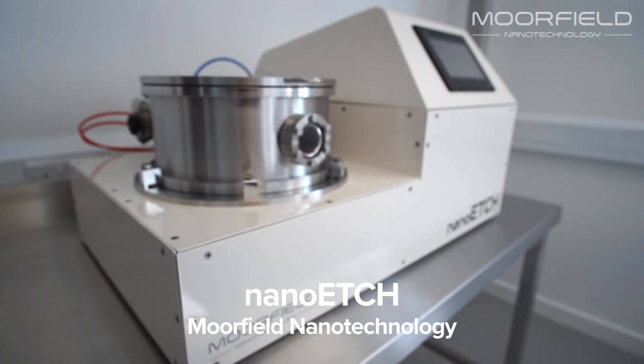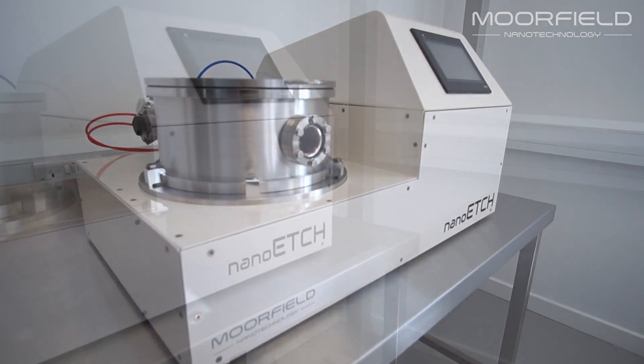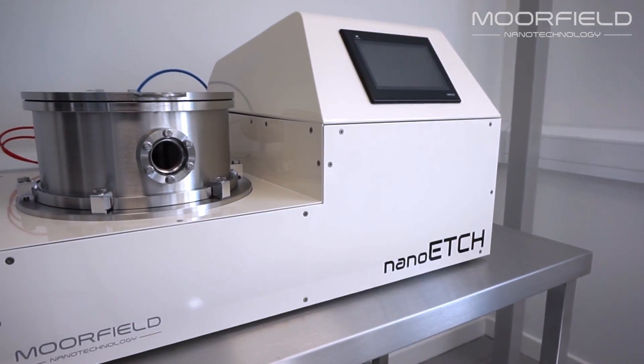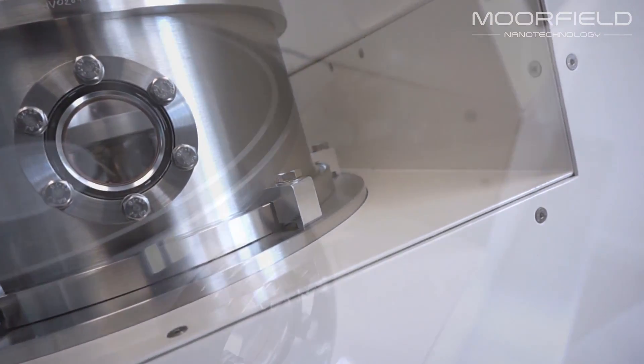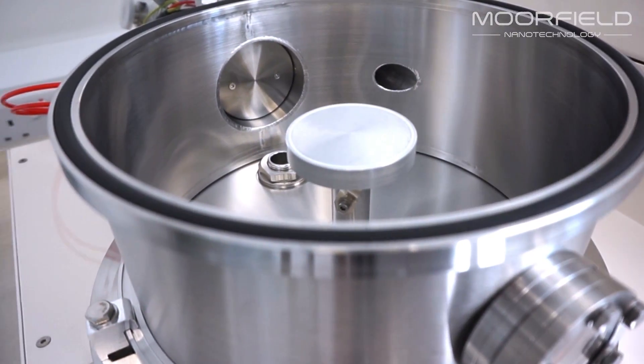The Nano Etch is a benchtop tool fitted with unique soft etching technology from Moorfield. Unlike conventional etching systems, soft etching technology is focused on precise control at low plasma powers. This is ideal for working with sensitive atomically thin materials such as graphene.